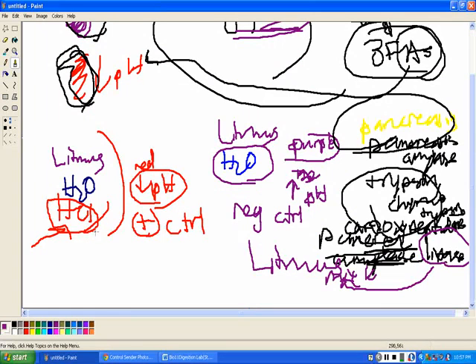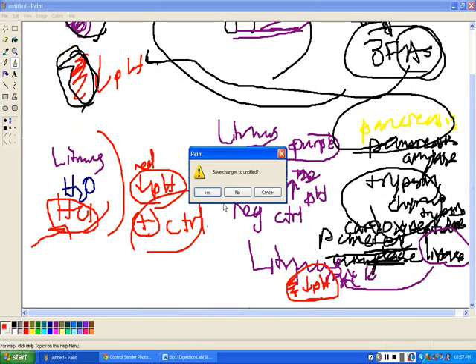And those 3 fatty acids are going to cause the litmus to change color from purple to reddish in color due to the lower pH from the fatty acids. So we compared that with our positive control and see, yes, it does change kind of pinkish, reddish in color, giving us our positive result.